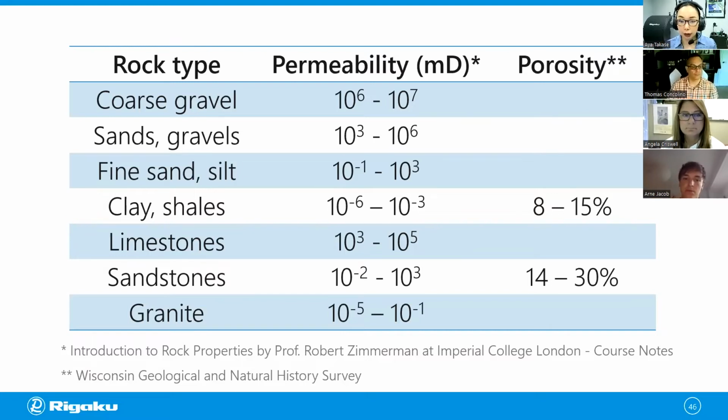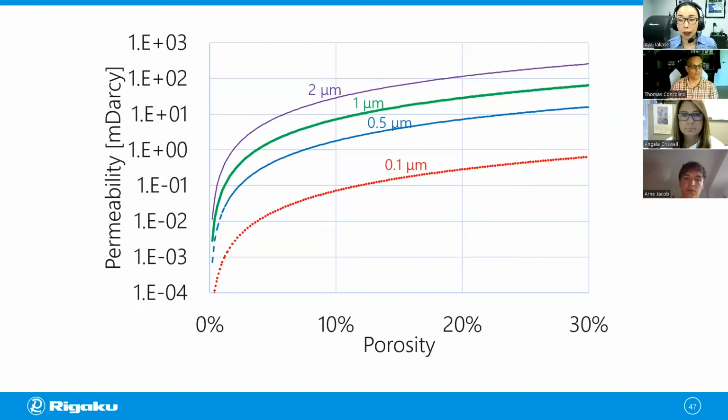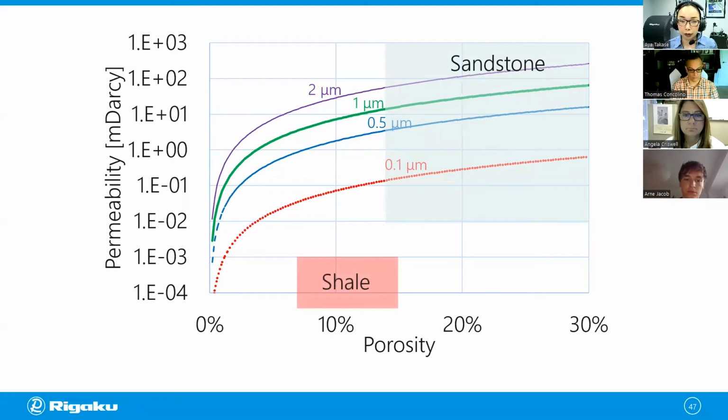And what this means is, going back to this plot, sandstone data points scatter somewhere around here, and many of them can be analyzed using micro CT images. But the shale data points scatter here, meaning that regular CT scanners are not going to be good enough to look at shale and do this type of analysis. You're going to need electron microscopes to do this.